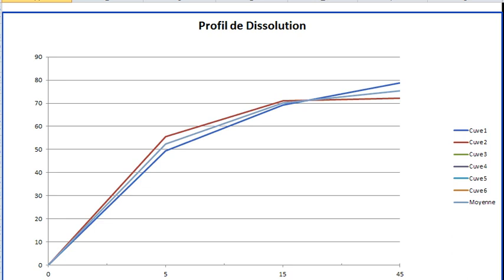This is the end of this presentation. I repeat that this is not exhaustive. For example, the tool allows to use calibration curves instead of 100% point.